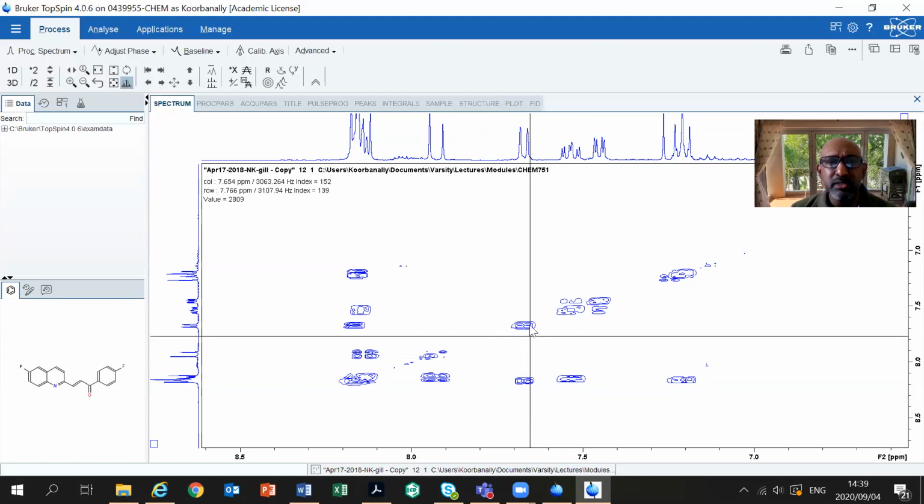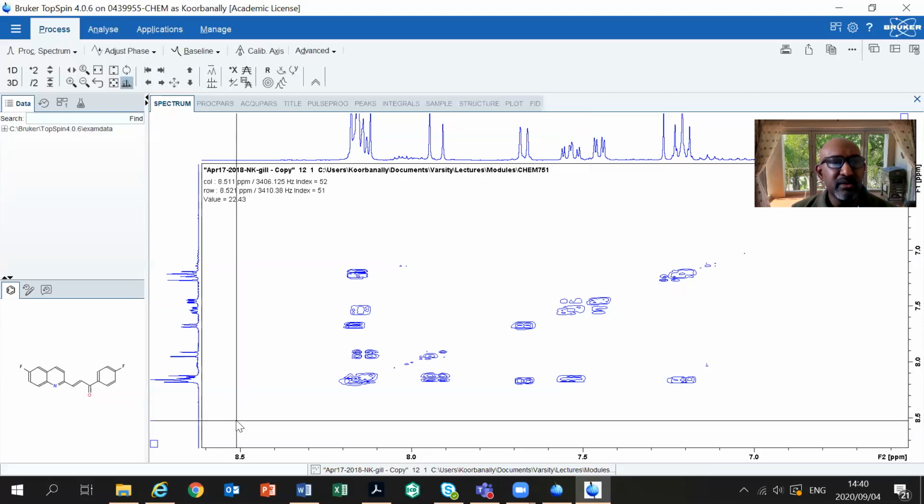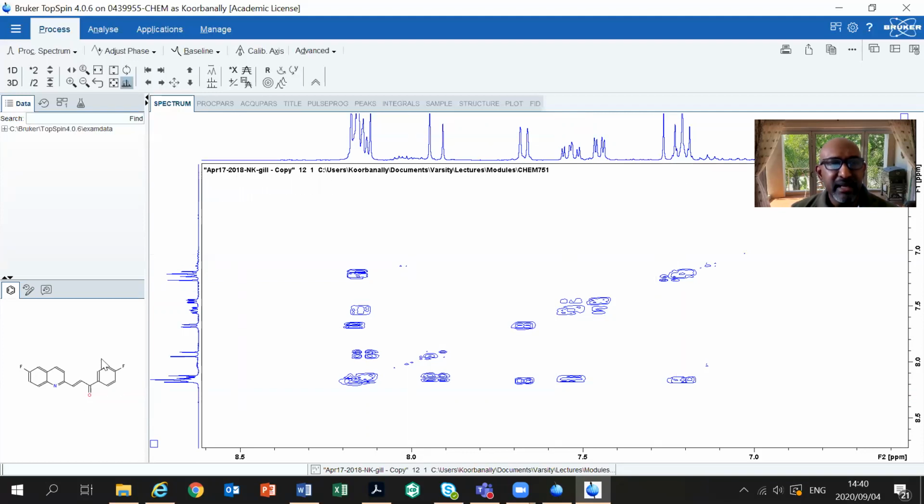And I'm going to use this triplet that I have here. Now, this is a pseudo triplet, like what I've just indicated when I discussed this with you. If I look at the pseudo triplet, it means that I need protons next to each other and also a system where there are no other protons affecting it, all right? If I look at this other aromatic ring, and I'm jumping straight to the other aromatic ring because I've dealt with this aromatic ring here. I'll look at this in a moment and I'll look at that in a moment.